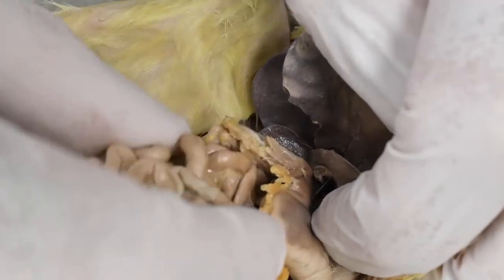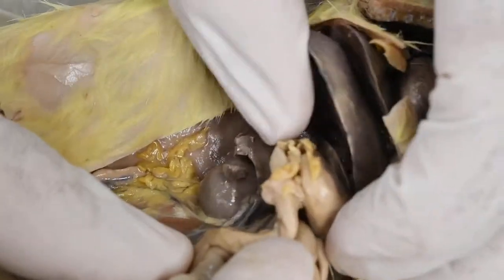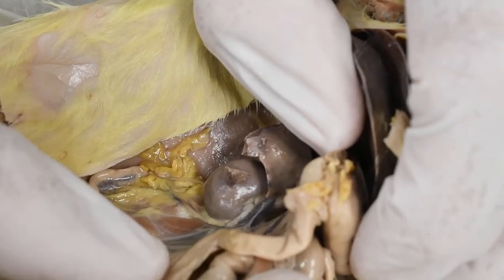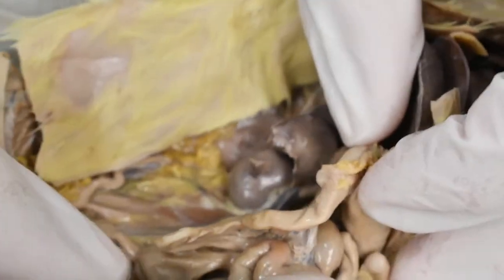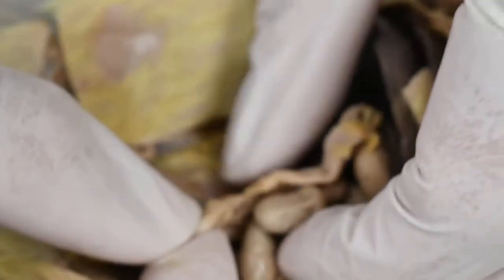Just like in the frog, the small intestine of mammals is divided into a couple of parts, actually 3 parts, whereas in a frog it's just 2. So in mammals, the first part is the duodenum, just like in the frog. Now, the way the duodenum is defined is you follow it down, all right? See how it makes a turn at this point?